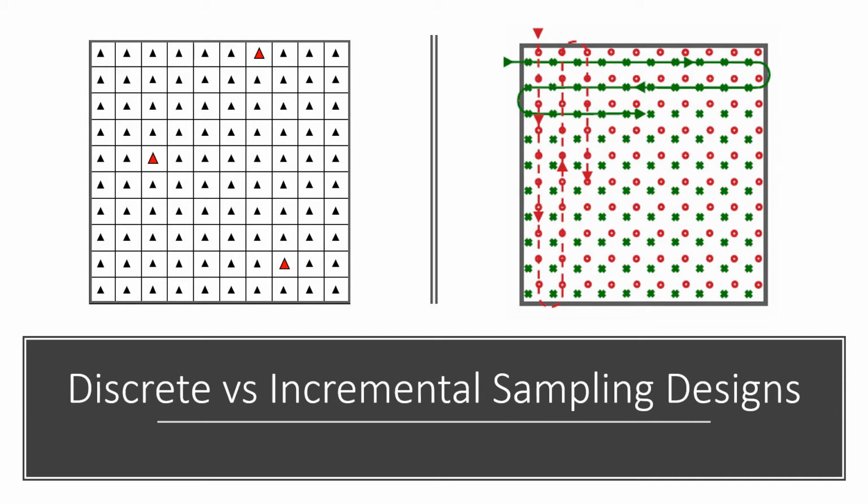shown on the left. If a more detailed understanding of the distribution of the contaminants, the nature and extent of the contaminants across the space is needed, an alternative to ISM might be to collect high-density discrete samples, for example, collecting all of the triangles in the figure on the left and analyzing those samples using an HRSC analytical method such as XRF. The variability of the high-density discrete samples is still likely to be higher than the variability between the replicate ISM samples, but they provide that additional information about distribution.